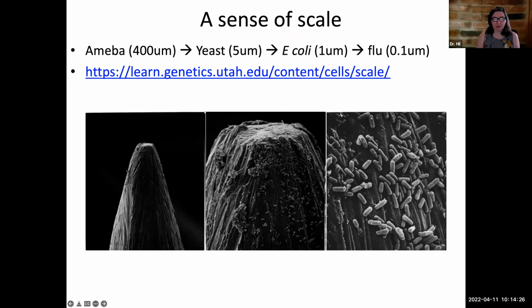I've mentioned this before, I'll mention it again, that I think it's really helpful in this field, when we're dealing with things that are unable to be seen with our eyes, to use the wonderful animation techniques of today to zoom into that tiny world to start to get comfortable with it, because then you can hold a picture in your mind. And for most people, that's really helpful. So this is a zooming in animation tool that's really great.